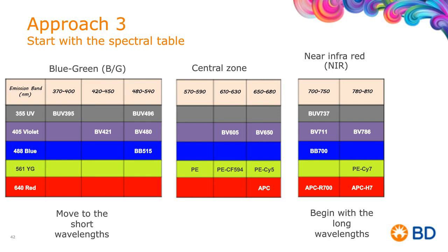And what he does at the end is that he saves the specificities that are low expressed for that valley of doom that we all know by looking at our spread matrix and the real data, where there is a significant amount of spread when we look for CD4s, but when we look for many of these markers in deep panels, well, there's not enough receptors there to actually cause a lot of trouble.